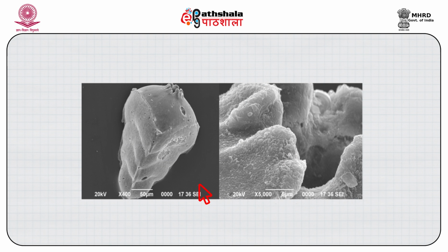As the backscattered electron image, which is an elastic scattering event, distinguishes the composition, in this figure the inelastic scattering leads to generation of an excellent image where the microfossil ornamentation and parts are detailed.